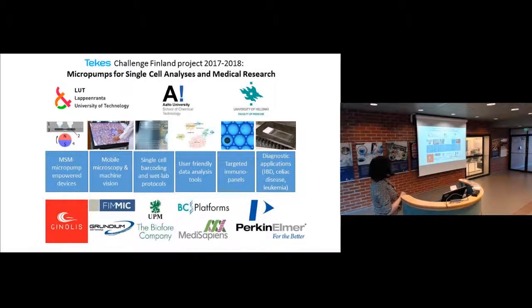So the prototypes of the chips we are doing with Joksa and Sami here, and then we have also companies involved. So Perkin Elmer is of course a big global company having lots of research activities in Turku site. And then we have 2 bioinformatics companies involved making user-friendly data analysis tools for single-cell data.